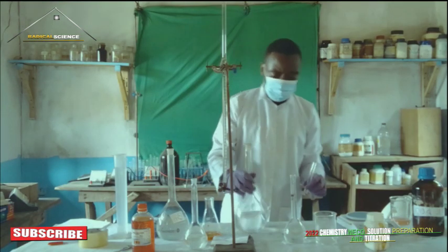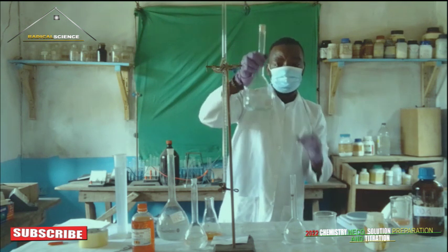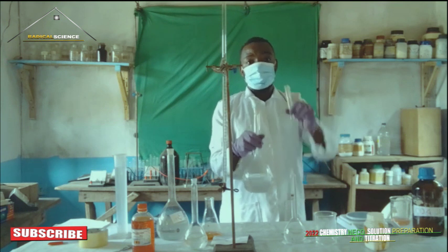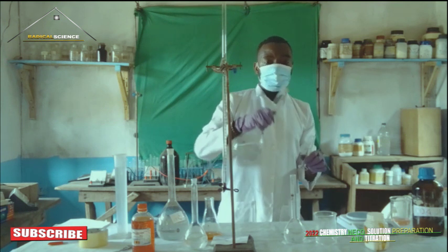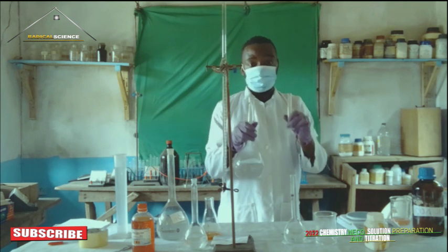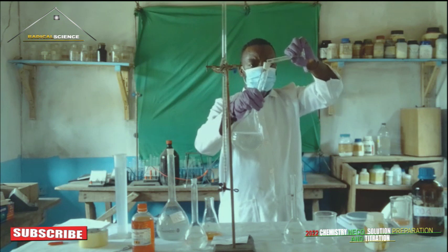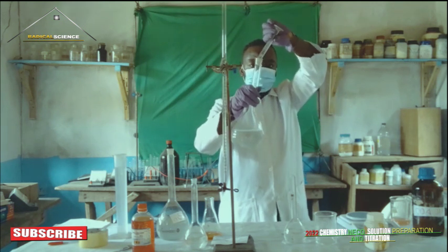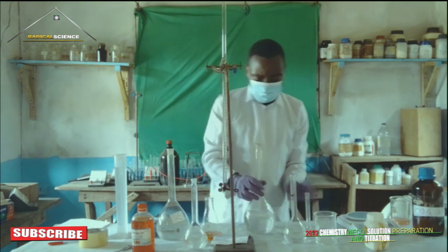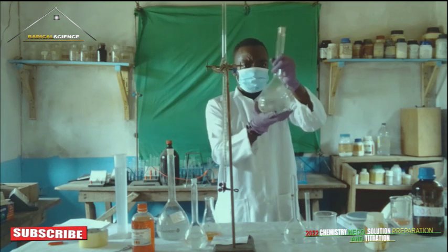This is our volumetric flask, which is our AN, filled with water to this particular level. All we need to do now is add this in here. Remember, you don't add water into acid, rather you add acid into water. They say we should dissolve it in 1000 cm cube. So first of all, you shake it to dissolve it properly.